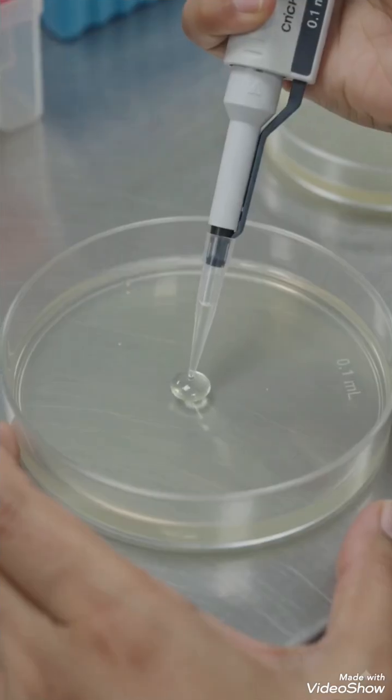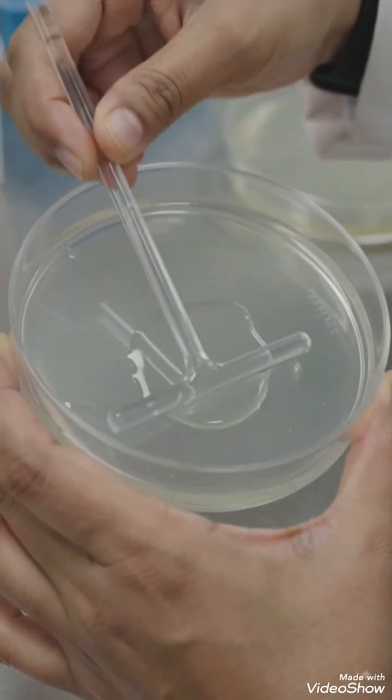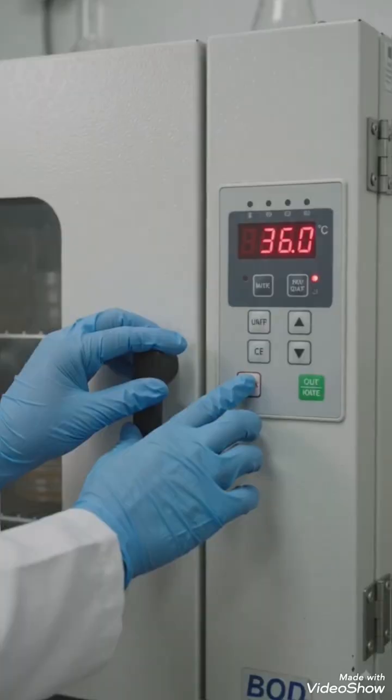In the spread plate technique, transfer 0.1 milliliter of diluted sample onto a solidified agar plate. Spread evenly using a sterile L-shaped glass spreader. Incubate the plates upside down at 35 to 37 degrees Celsius for 24 to 48 hours in BOD incubator.